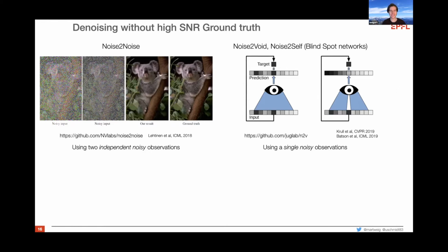but they have a different noise each time, right? And the interesting part is if you just train the same approach as before, just using the noisy second image as the output, which is actually not a clean or high SNR output, but just another noisy instance of the same scene. You use the same method and train a network to try to recover the second noisy image from the first with different noise instances. It's actually impossible to predict pixel-wise independent noise from different instances. So it cannot really recreate the noise patterns, it has no information how to do that. The only thing it really can recover is the underlying clean signal or the mean of that noise distribution, right? And that's what it does actually.